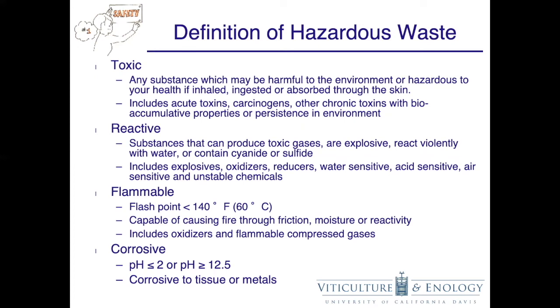Reactive substances are substances that can produce toxic gases or explosions, react violently with water, or contain cyanide or sulfide. This includes explosives, oxidizers, reducers, water-sensitive, acid-sensitive, and air-sensitive, and unstable chemicals.